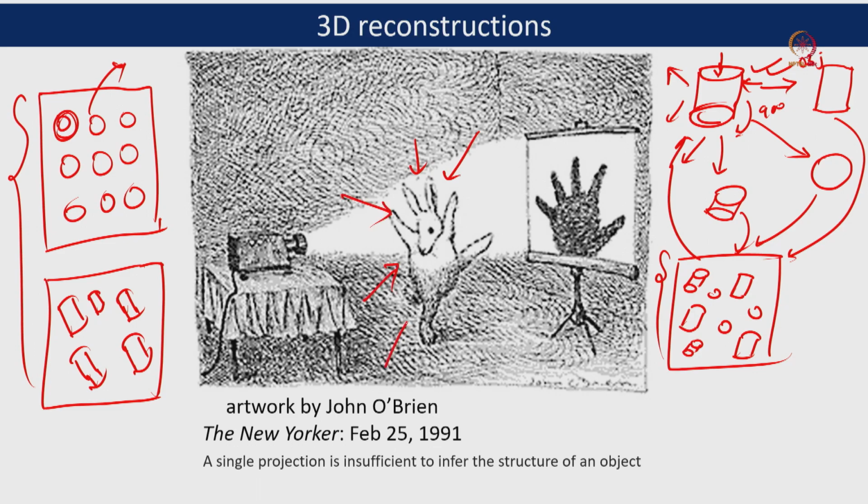So if we have only one particular orientation of this 3D object, and we have this kind of image, we cannot get any 3D structure from those images. That is one of the reasons we need a very high number of data sets for any 3D reconstruction, and it should satisfy all the angles.